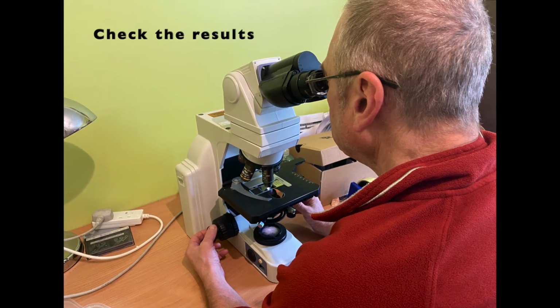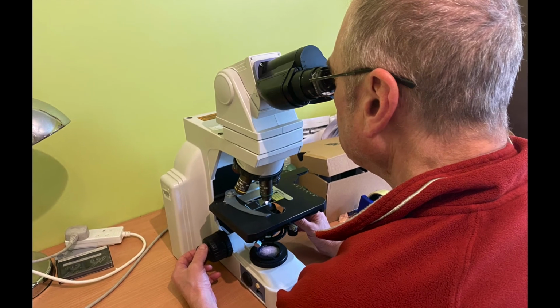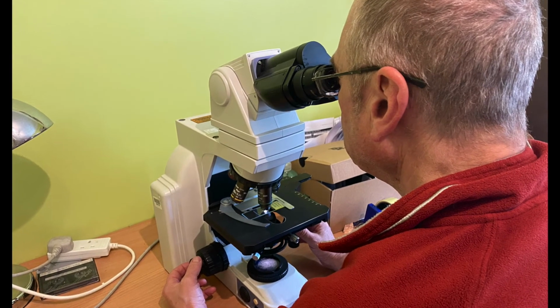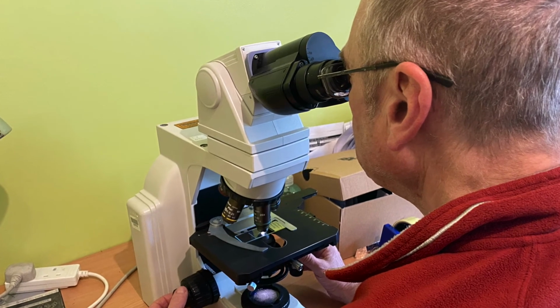Check the results. Take your slide to the compound microscope and check your work. Check to see if the structures of interest, in this case spores, are suitable for further analysis.